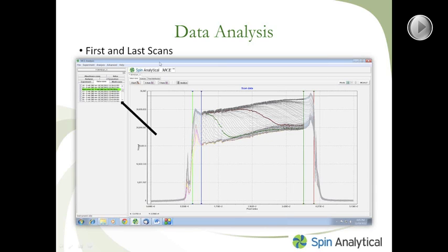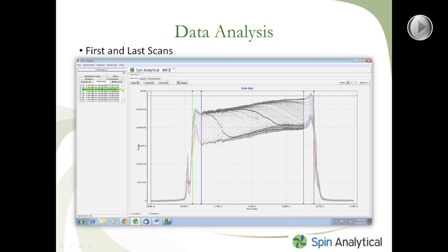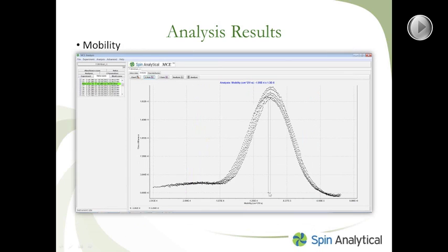At that point, all you have to do is press the Analyze button, and when you do, it takes the first difference between those. The peak in this curve corresponds to the position of the center of the boundary, corrected from position to electrophoretic mobility. So if we go back over here, our x-axis is now the electrophoretic mobility of those boundaries as they move down the cell.